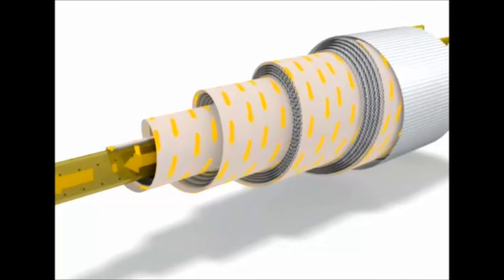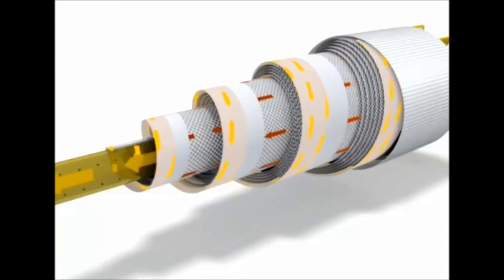The membrane is constructed such that the permeate is transferred to a perforated central tube known as the permeate tube from which it leaves.